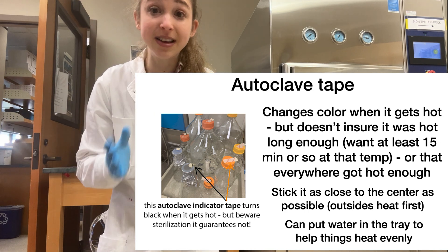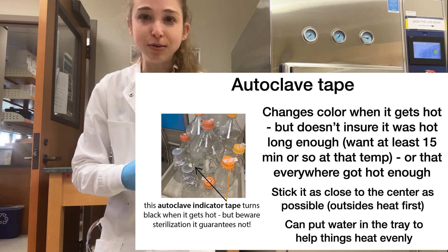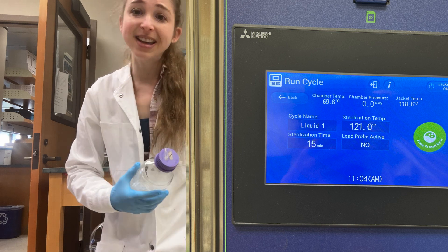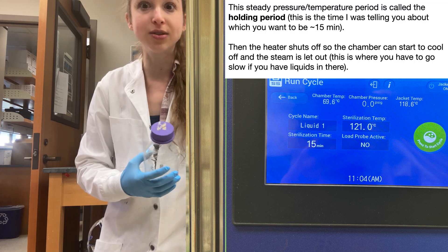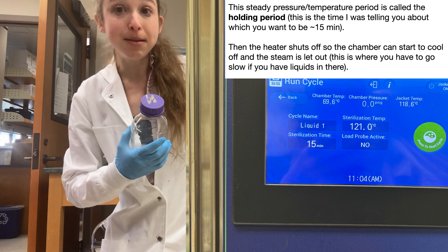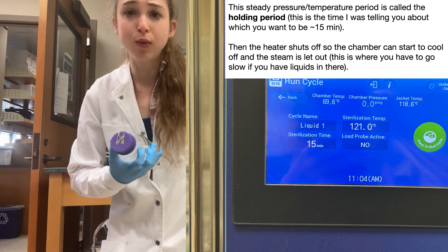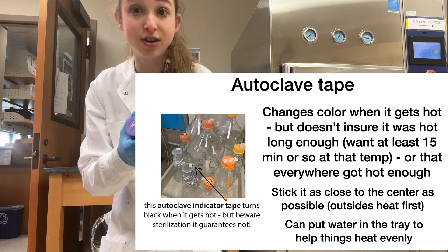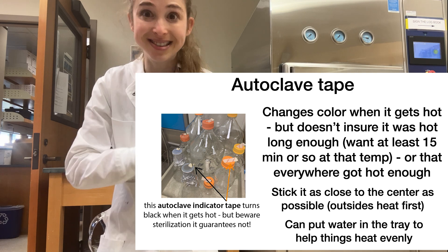The tape shows that it got hot enough, but doesn't really tell you how long it was hot. When you look at an autoclave it'll have cycle times — typically something like 15 minutes — but it's actually going to take you like an hour. Remember, it's got to build that pressure, and then when you have a liquid it's got to depressurize slowly. The 15 minutes or whatever is when it's supposed to be at that hot temperature — maybe 120 degrees Celsius — for 15 minutes. The tape, as long as it gets there at all, it'll turn color. It's also good to put the tape in the center of the thing you're using, so you make sure the center got hot enough.